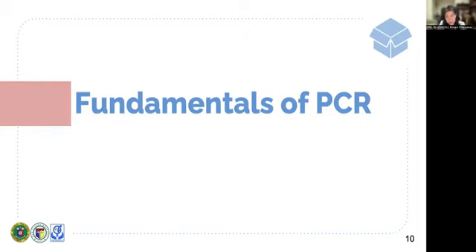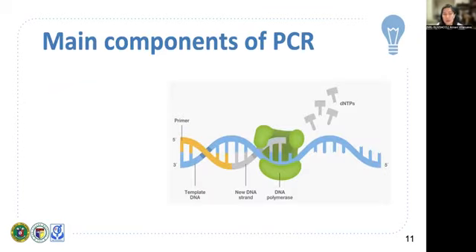So now that we've discussed those important concepts, we can now move on to the fundamentals of PCR. So what are the main components of your PCR reaction? So actually present in your cocktail of PCR mix, you have the following.